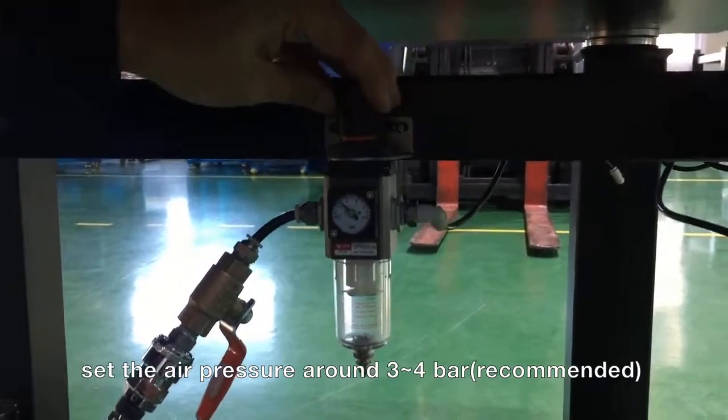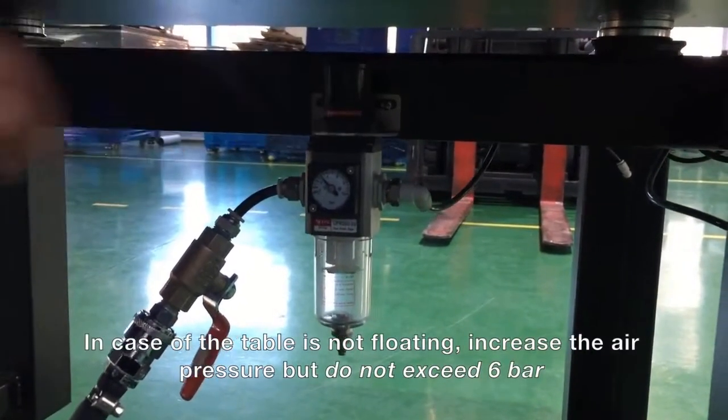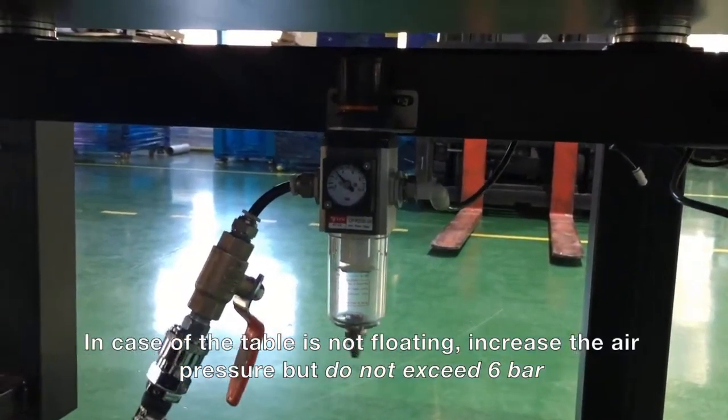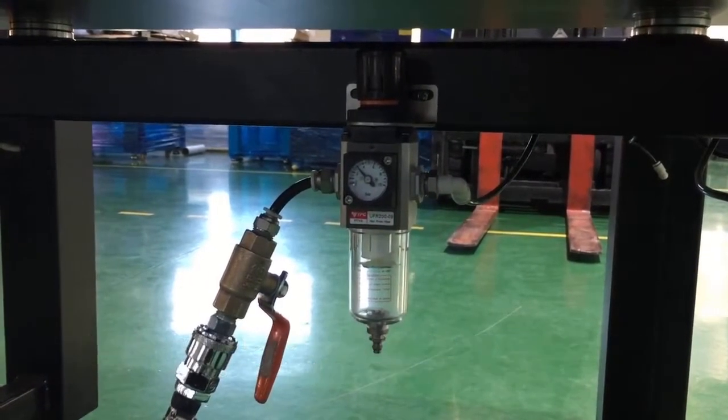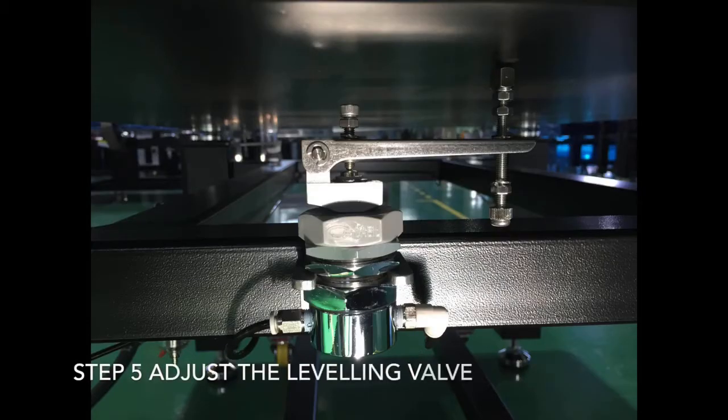In case the table cannot swing freely, increase the pressure steadily. Remember that you should not add more than a maximum of 6 bars to the system. Adjust the lever arm screws so that the lever arm is horizontal.